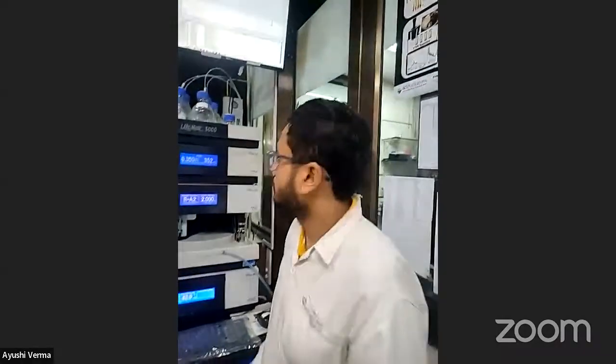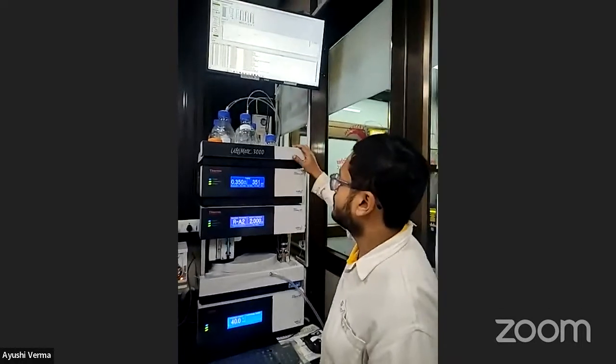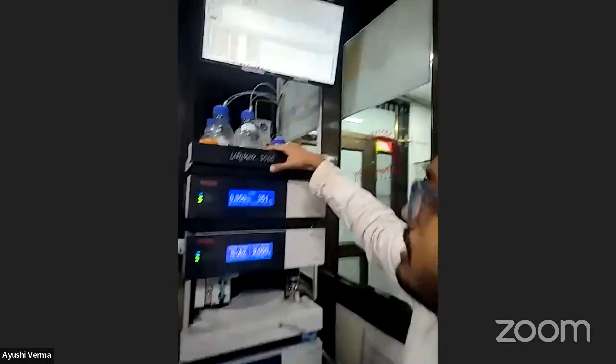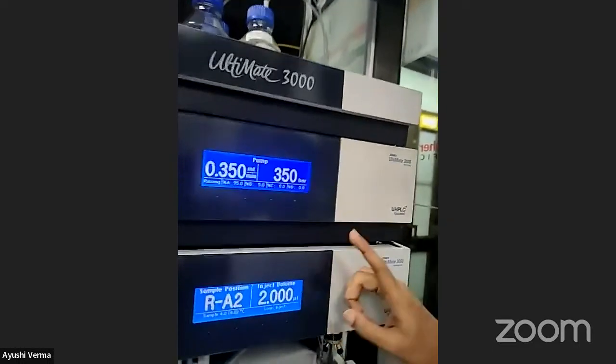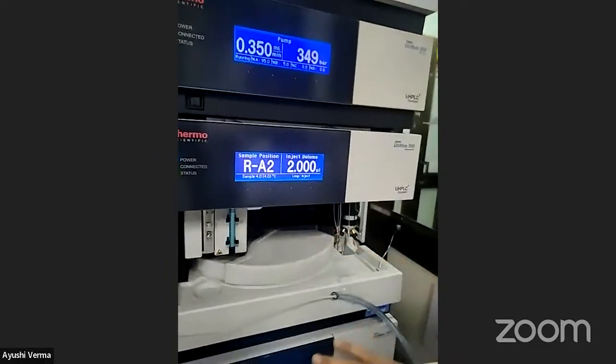Yeah. Hello, everyone. Good morning. So now we will be showing you the running of the sample for metabolite identification. As was discussed, in proteomics there is nano-LC, or the nano flow of the solvent. But for metabolites, what we generally use is the HPLC. Here we use a flow rate, as you can see, in the range of ml per minute. It is the same as what Avinash has showed: the same compartments of auto sampler and the column.